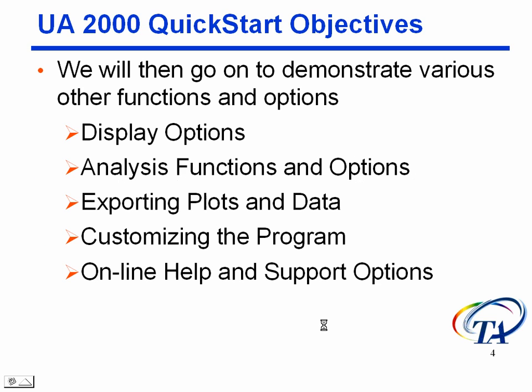Okay, and then we'll go on and demonstrate various functions and options of the program. Basically, when you're using the program, it boils down to 3 areas.